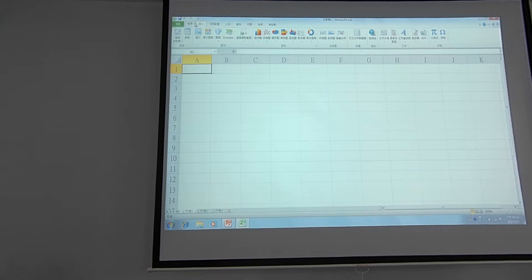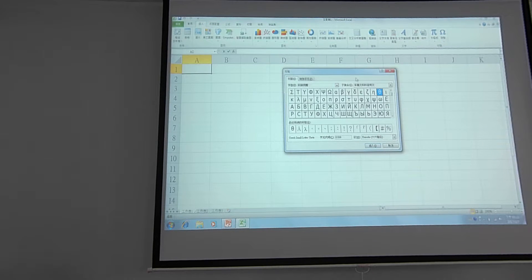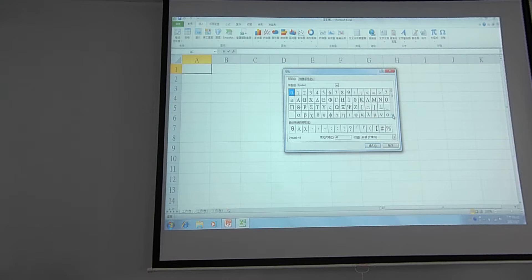Go with me and click this one — it means Insert. We need to insert a symbol. Let's go to the font called Symbol and find theta, because the first parameter we need to know is theta.